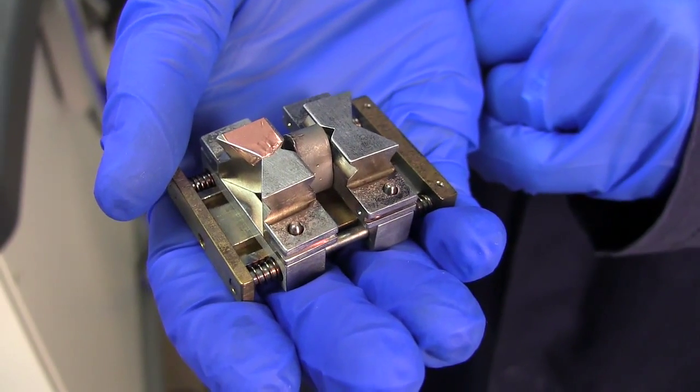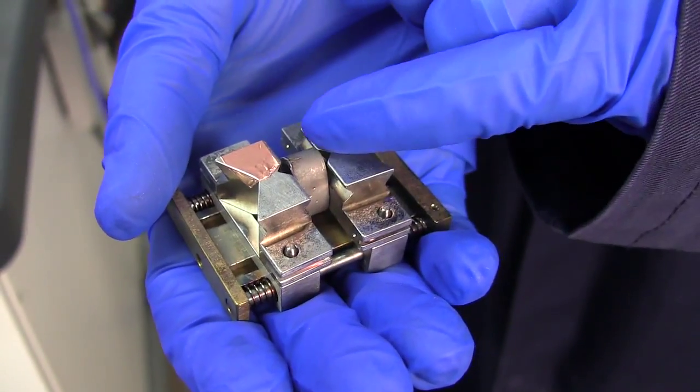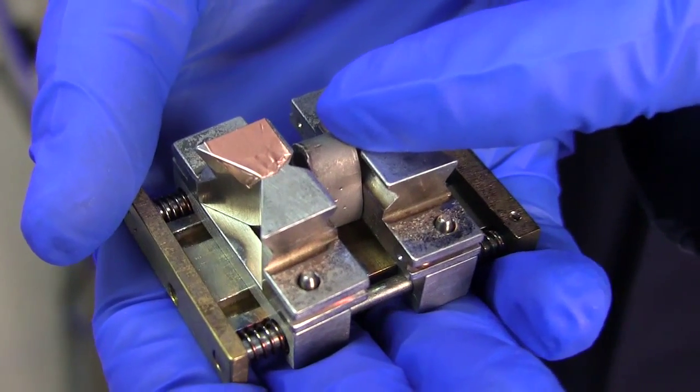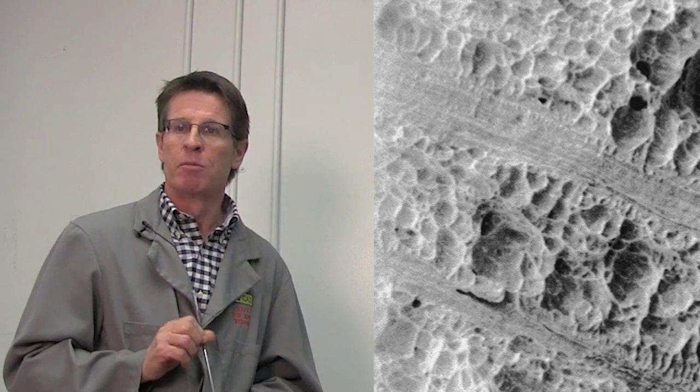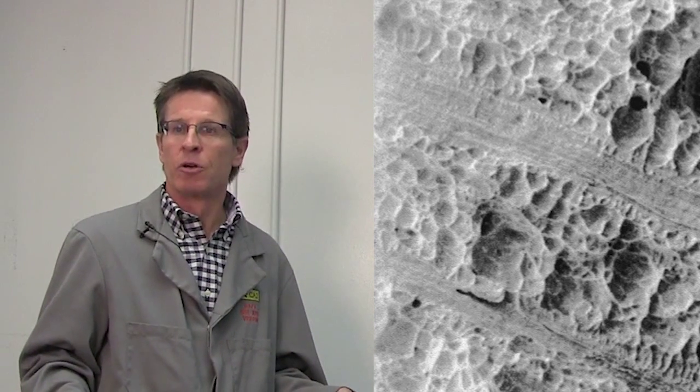Using the electron microscope, we find traces of the element chlorine along the bands in the image, not normally found in this metal. So what we learn from this is that if we can get the chlorine out of the material, we can make a much better material, and that's what we have in current generation reactors.